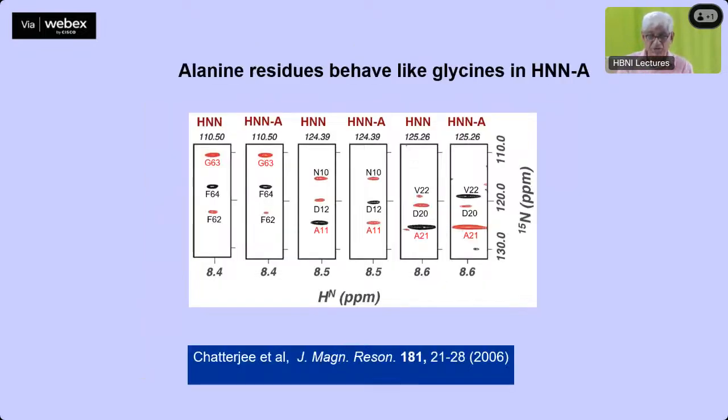You can see that effect straight away. The glycines will remain as glycine. Nothing happens to the glycines. Glycine patterns will remain there. So you preserve the glycine patterns and you also get alanine patterns like the glycine patterns.